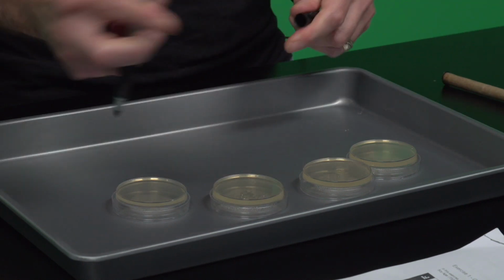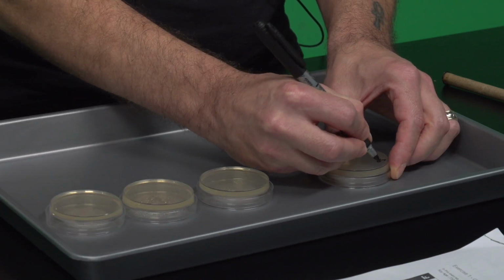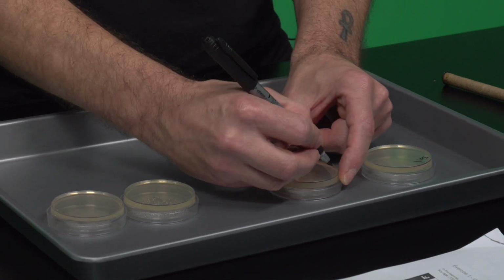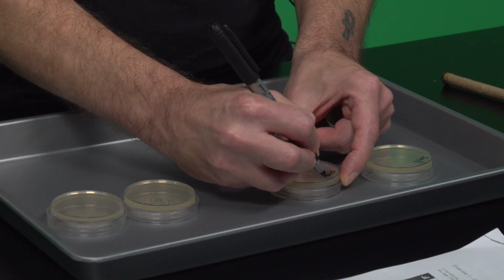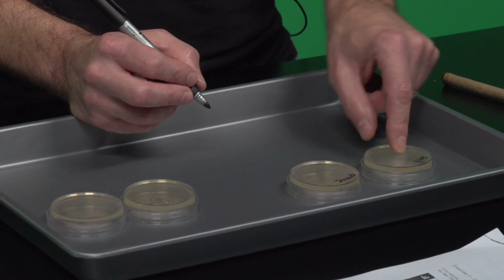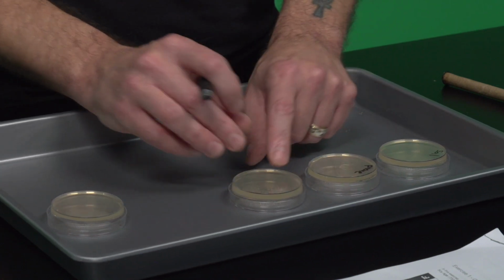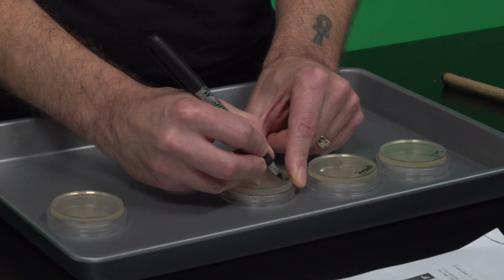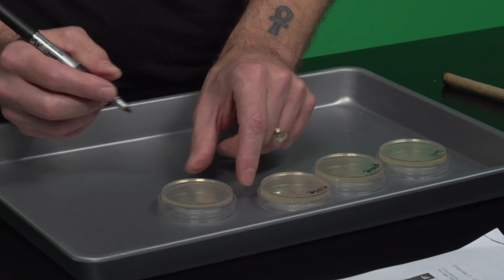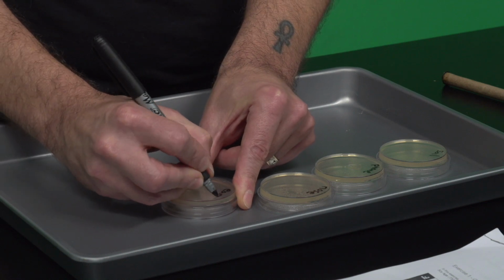So first thing we need to do is label these. I'm going to go ahead and label soil. For my other environment, I'm going to see what kind of microbes are on my phone. But you get to choose whichever one you want for that. Everybody's doing soil, but for the other environment, choose whatever you want. Over here, I'm going to swab my nose. And the other one, I'm going to swab, let's say, behind the ear.